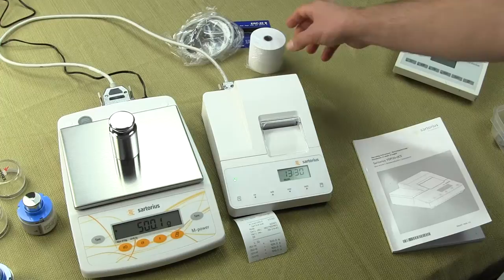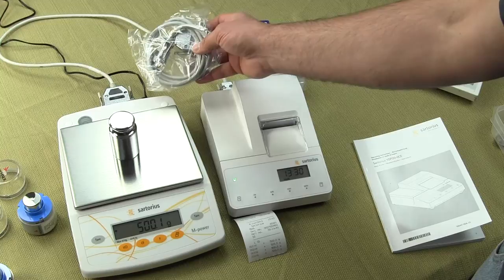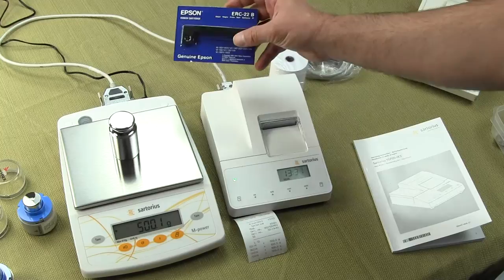The printer comes standard with a single roll of paper. It comes with the printer cable, which connects to any Sartorius balance that's outfitted with an RS-232 interface. This particular model is Sartorius' M-Power Basic Series, and we have it connected to the printer.